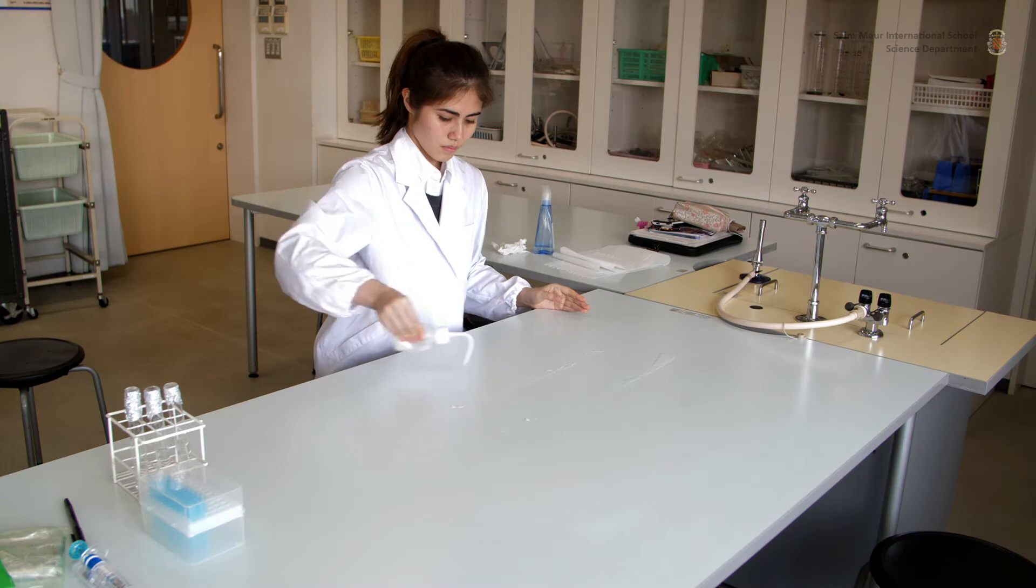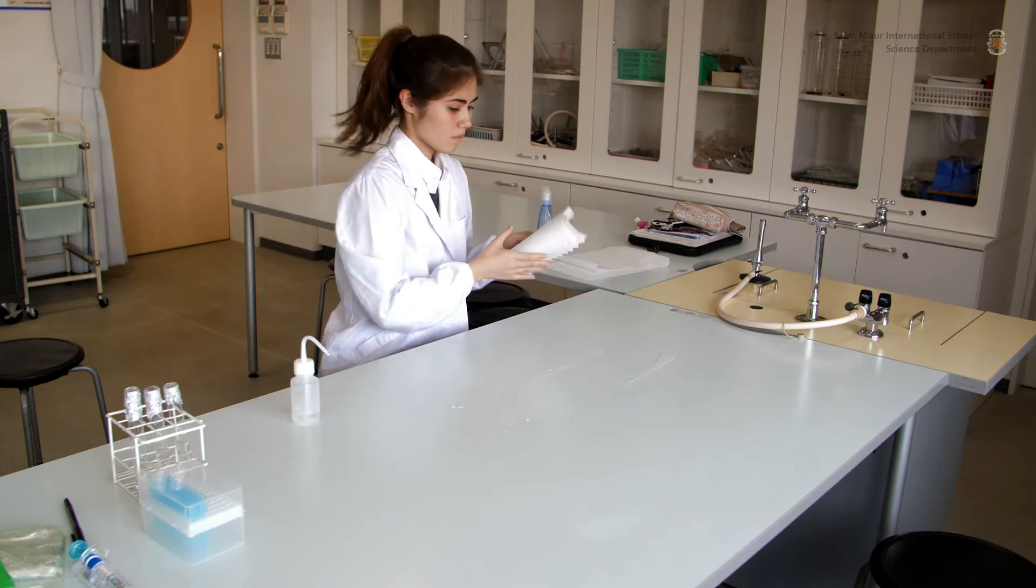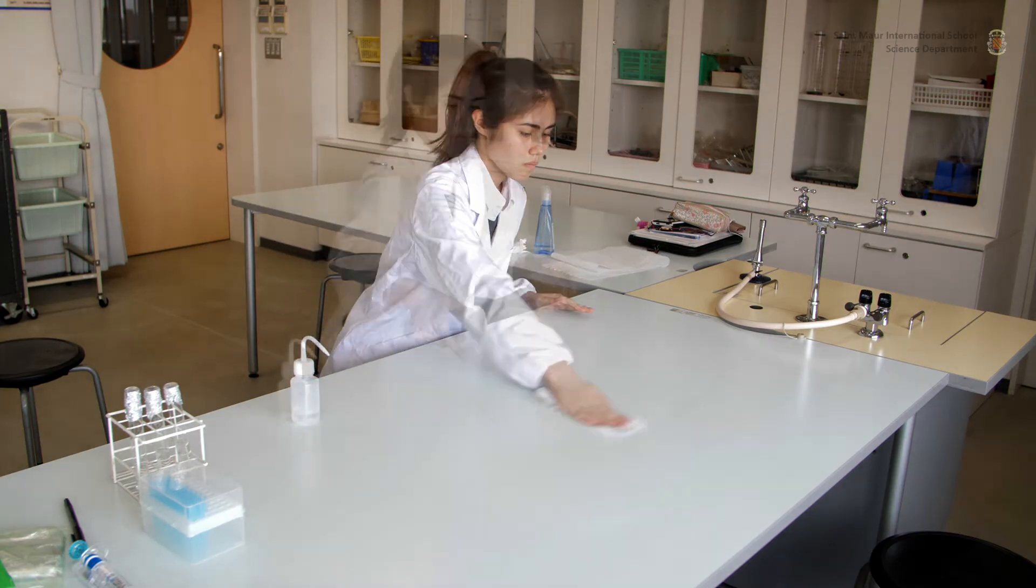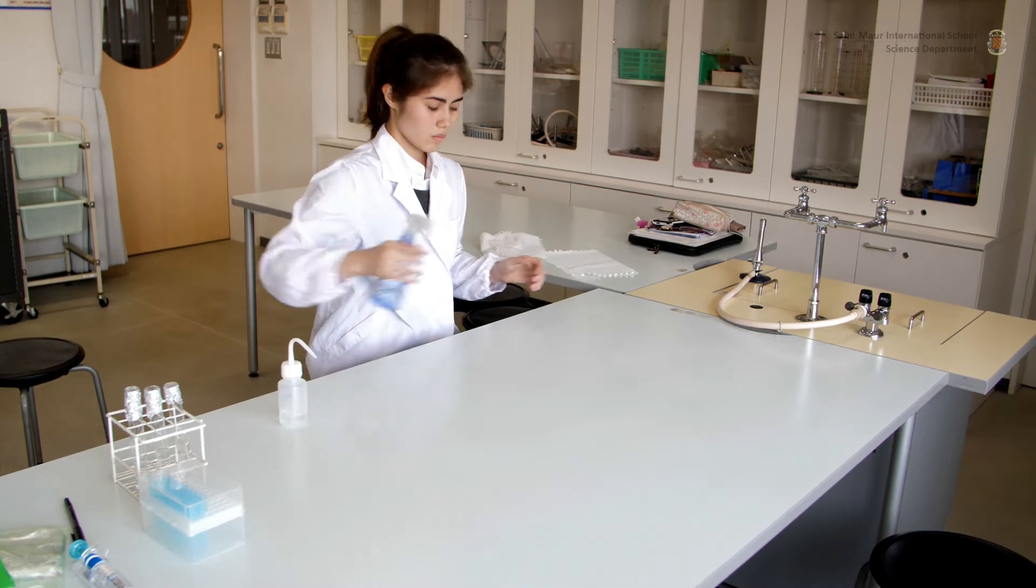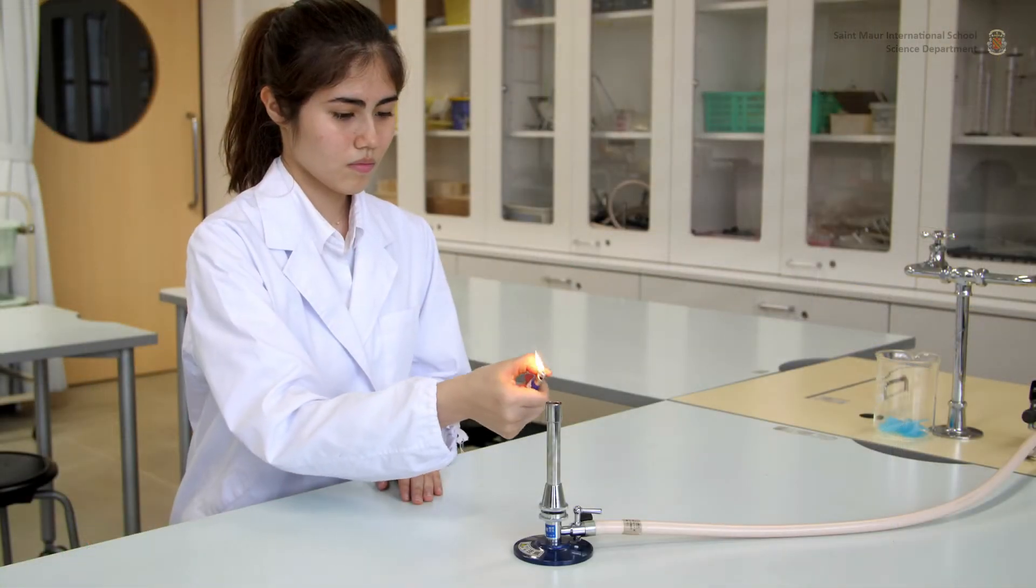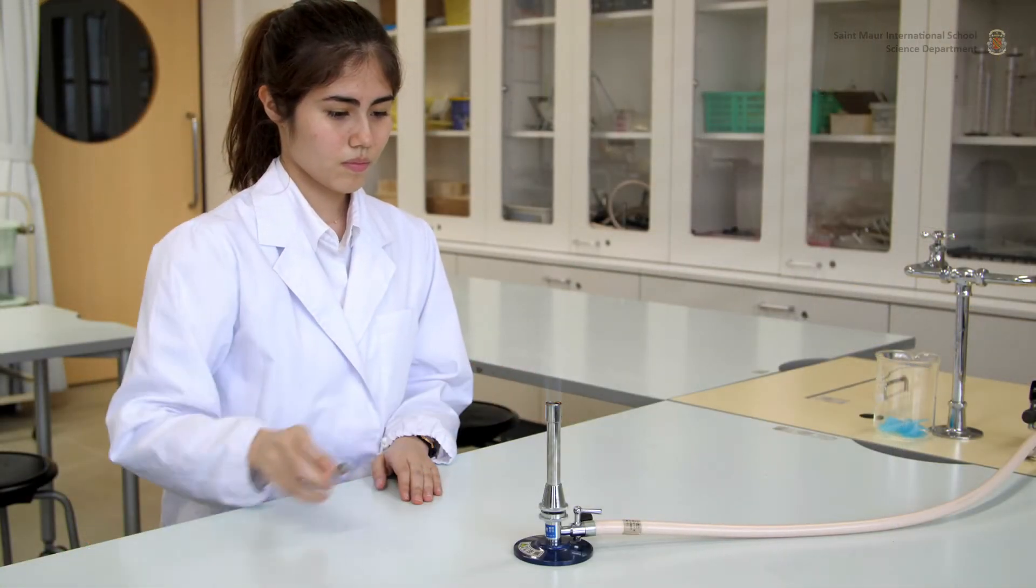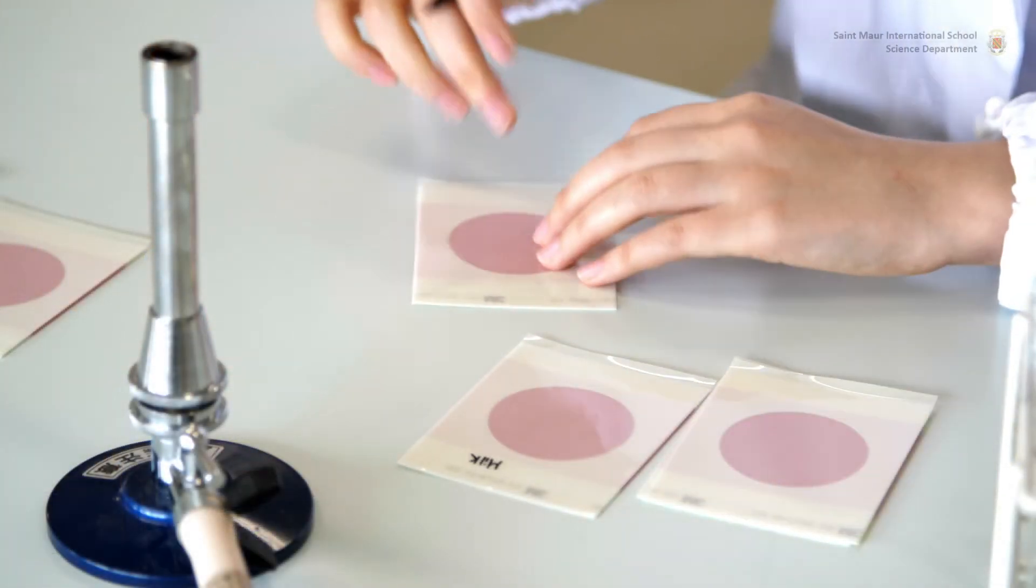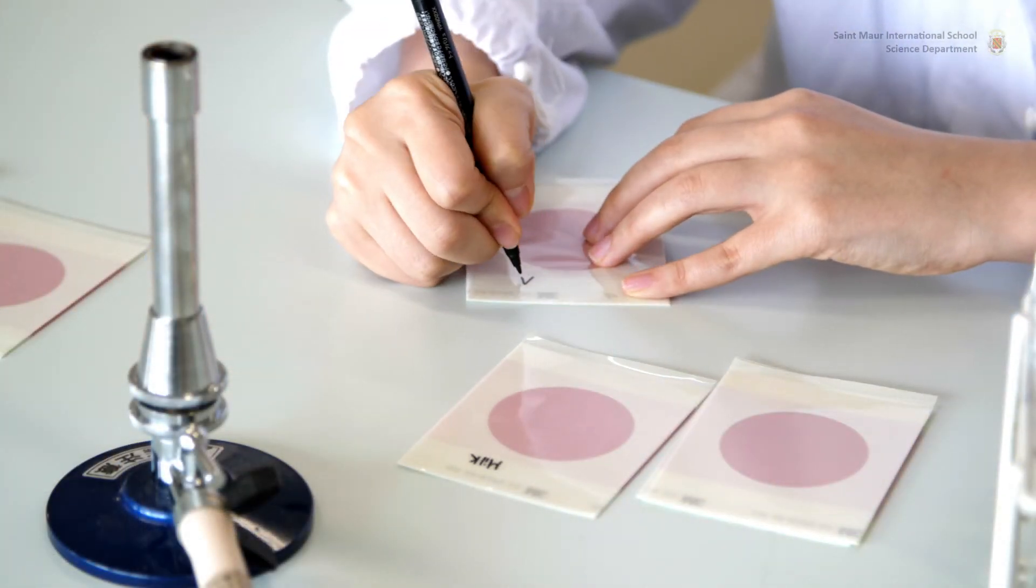Preliminary Steps: Sterilize the bench once with a 10% Milton solution and twice with 70% ethanol. Light a Bunsen burner to establish a cone of sterility. Make sure to label the covers of the petrofilms prior to inoculation.